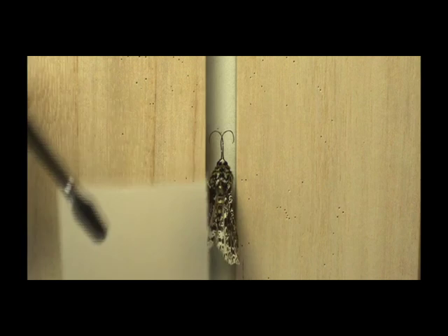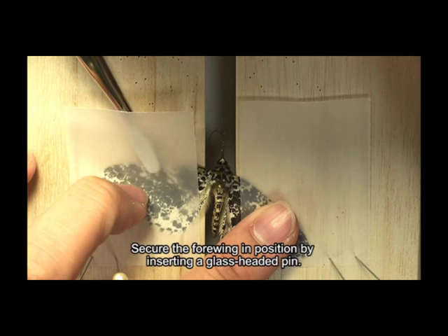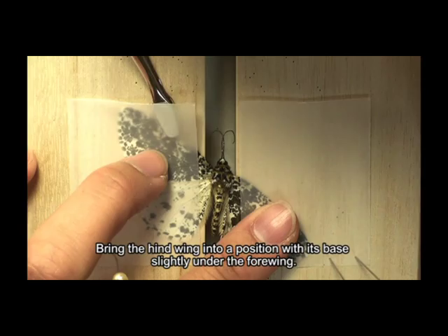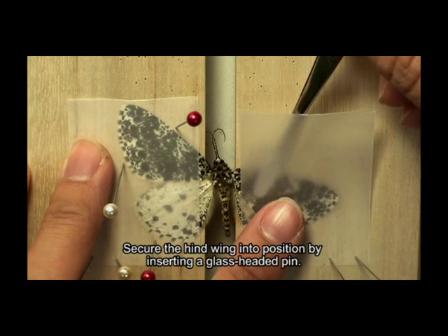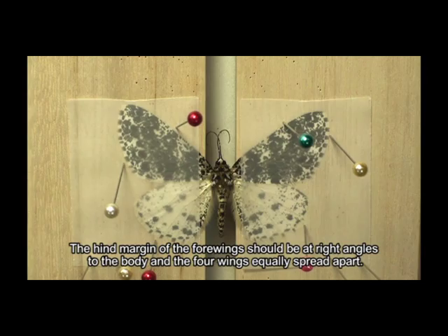As the specimen is properly positioned, the wings of the specimen are held by a strip of tracing paper. The wings are then moved into position by pins or forceps. Pull the forewing forward until the hind margin of the wing is at a right angle to the body, and secure it in position by inserting a glass-headed pin. Bring the hind wing into position with its base slightly under the forewing, and secure it by inserting a glass-headed pin. Repeat the same procedure for the wings on the other side; the hind margin of the forewings should be at right angles to the body and the forewings equally spread apart.